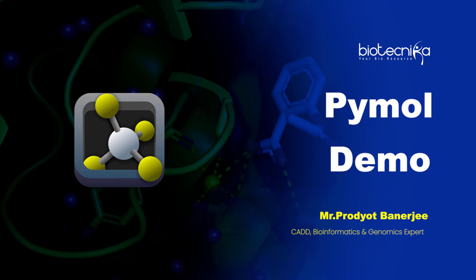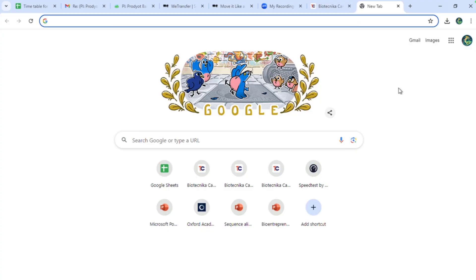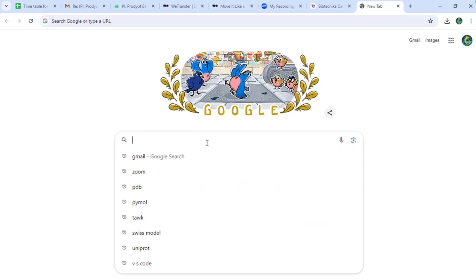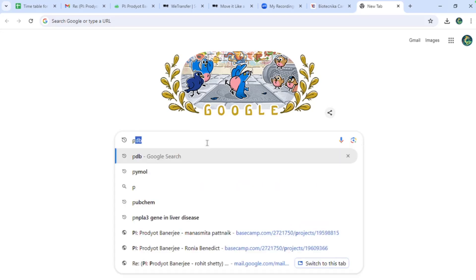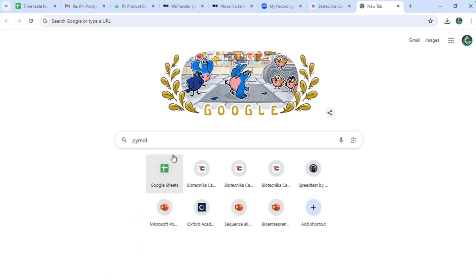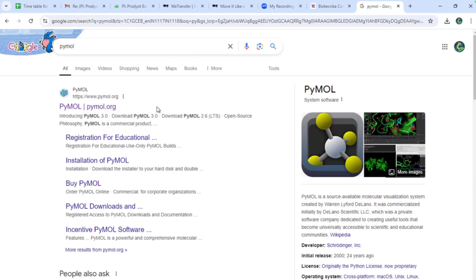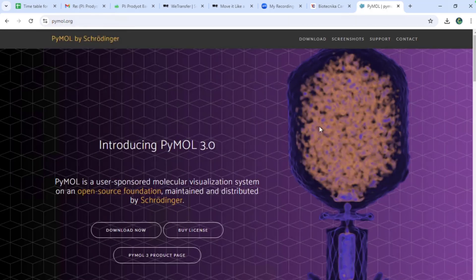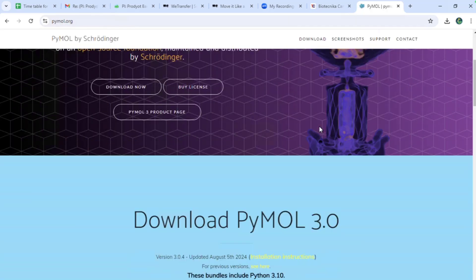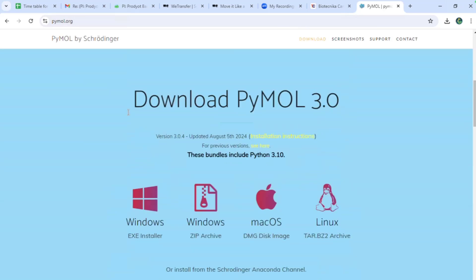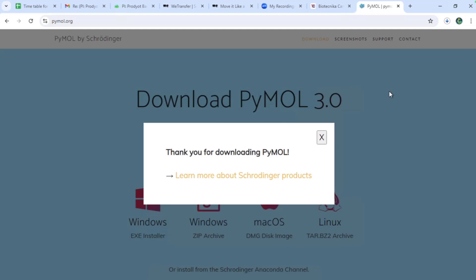All the files are available for Mac, Windows, Linux, and everything. Let's first have the demonstration for the Windows system. In the search engine, we click on PyMOL. The first search result opens the PyMOL website, and here you can see the latest version, which is 3.0.